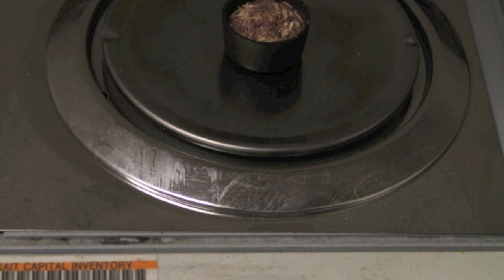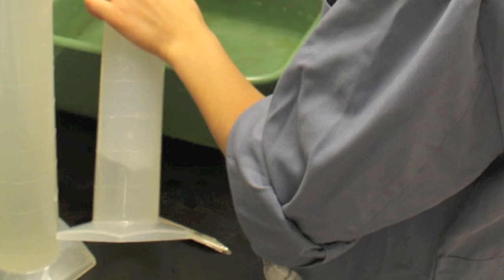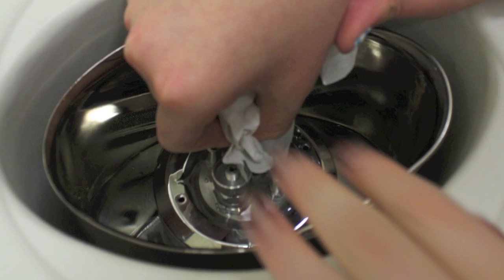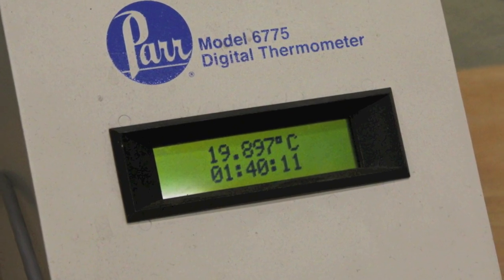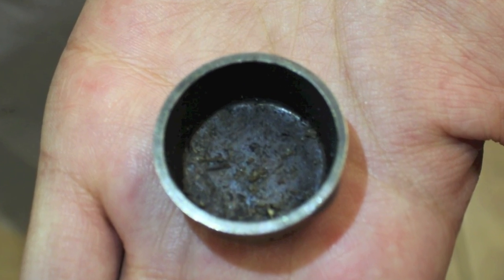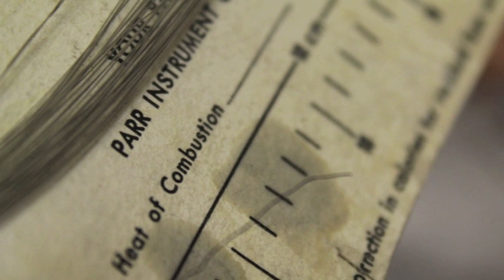An electronic scale, the bomb head and crucible, two 1.0L graduated cylinders, the steel container, the temperature and time monitor, the crucible, the calorimeter plus stirrer, and fuse wire.